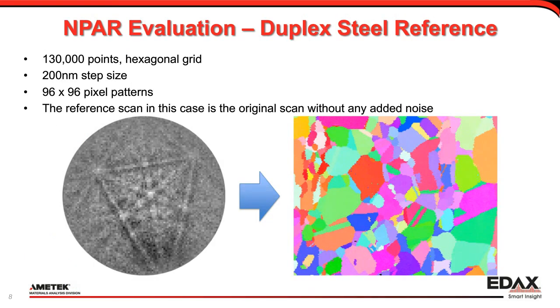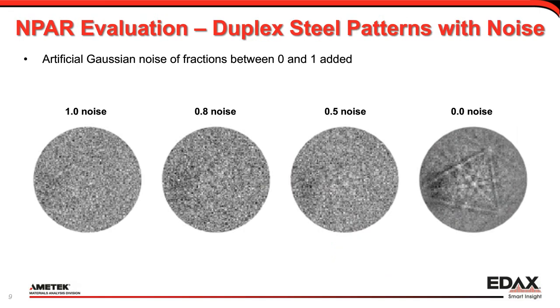To show this as a model experiment, we collected a very high quality map at very slow acquisition rates to get very high quality diffraction patterns with a very high indexing success rate. You can see the map is very beautiful. We then artificially add noise to the diffraction patterns, re-index them, see how the noise affects the indexing and map quality, and then see how the NPAR routine does in bringing back both the diffraction pattern and map quality.